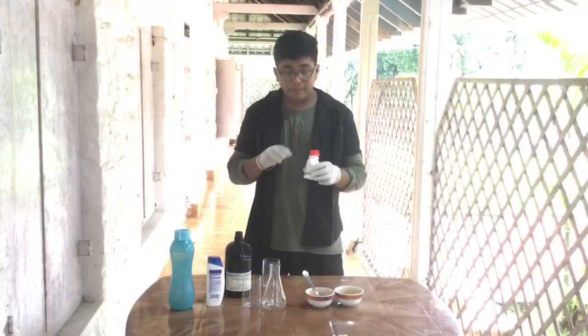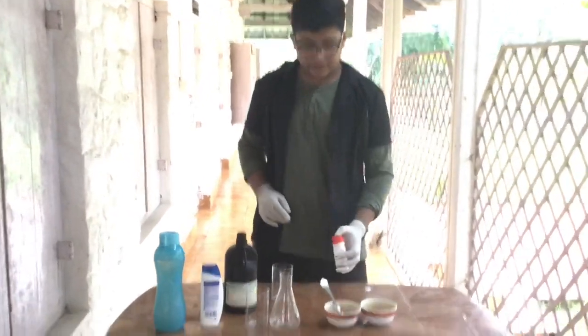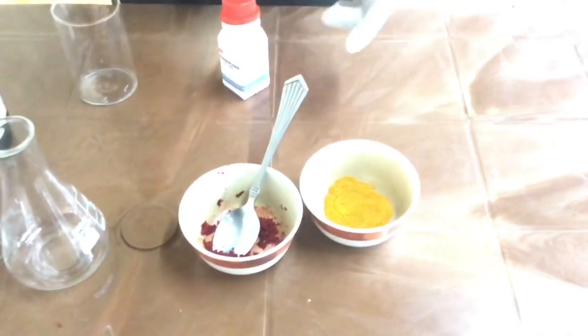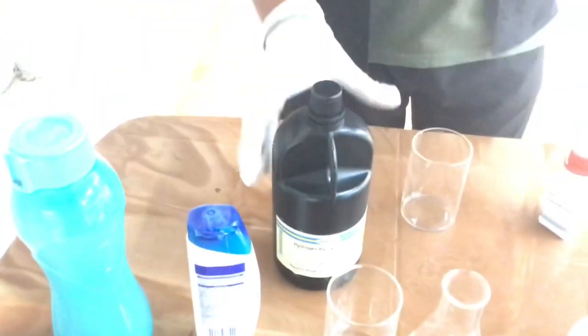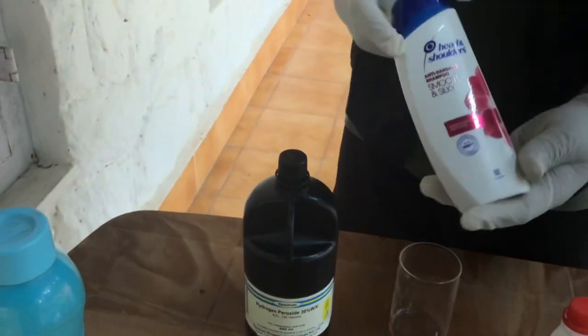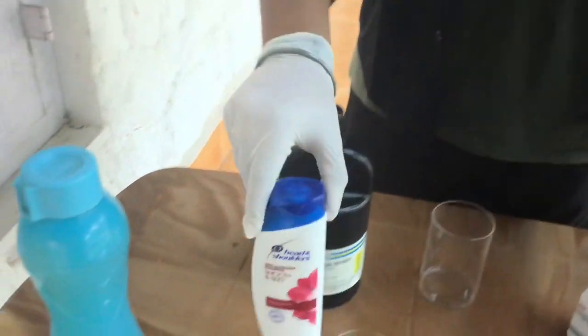So before mixing our potassium iodide, I'd like to tell you the materials that are required for this experiment. First of all, we need some food coloring. This is a red food coloring and this is yellow food coloring. We need a conical flask, a borosil glass, some hydrogen peroxide that is 30% concentrated, some potassium iodide in powdered form, some shampoo for the froth, and water.